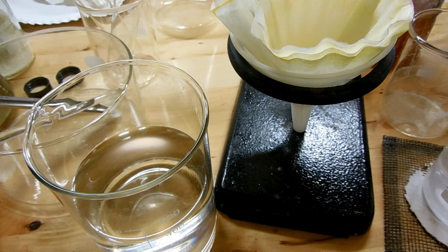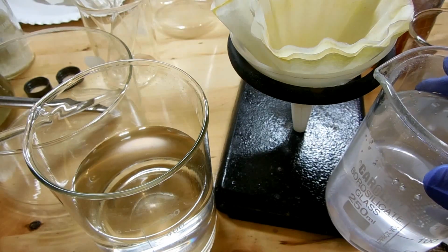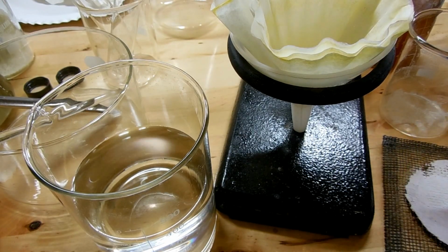Lead iodide is pretty insoluble at room temperature, as we've seen, but it is slightly soluble and therefore a little bit dangerous. So we want to render it into a form that's even less soluble. And I'm going to turn it into the carbonate. So I prepared a hot saturated solution of baking soda, sodium bicarbonate, and I'm going to be adding that to all of the things that had lead in them.